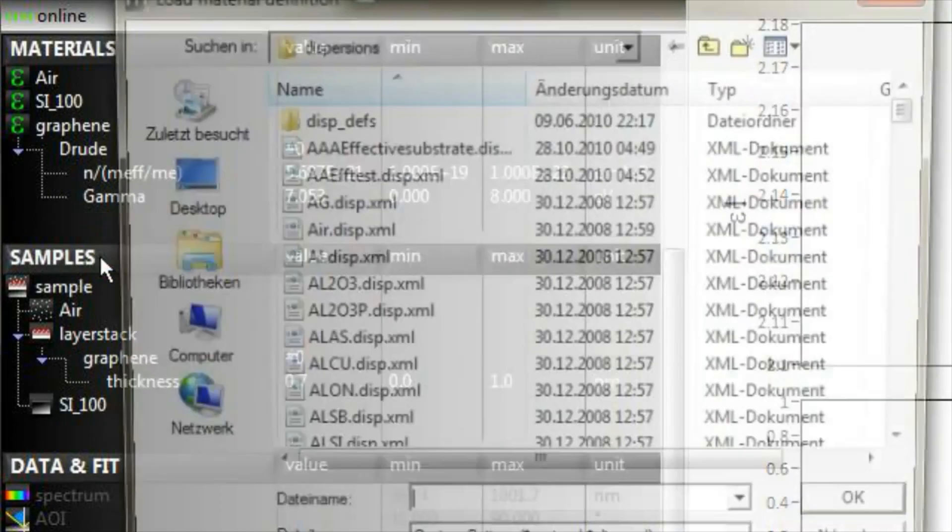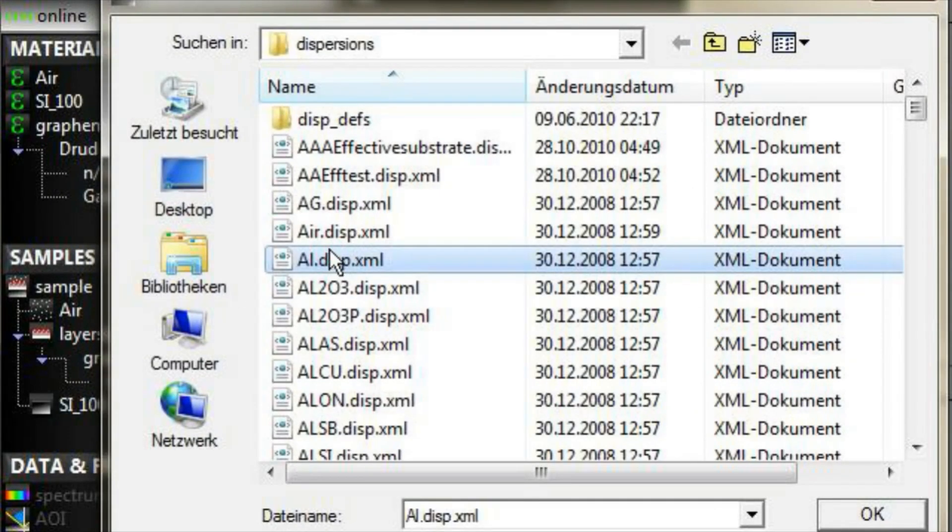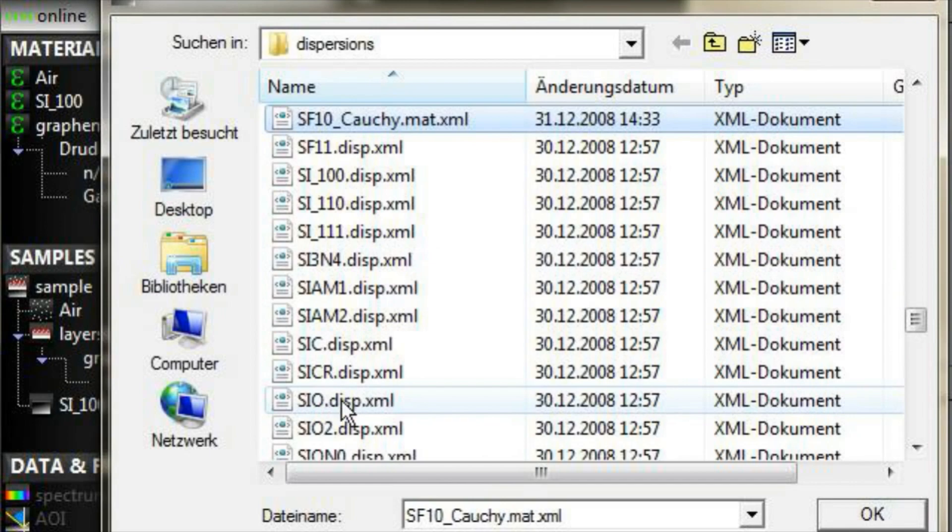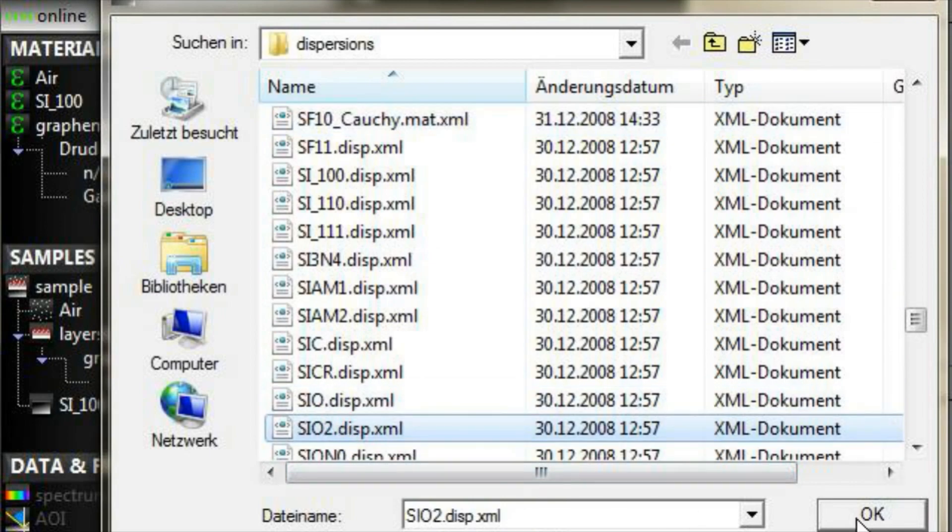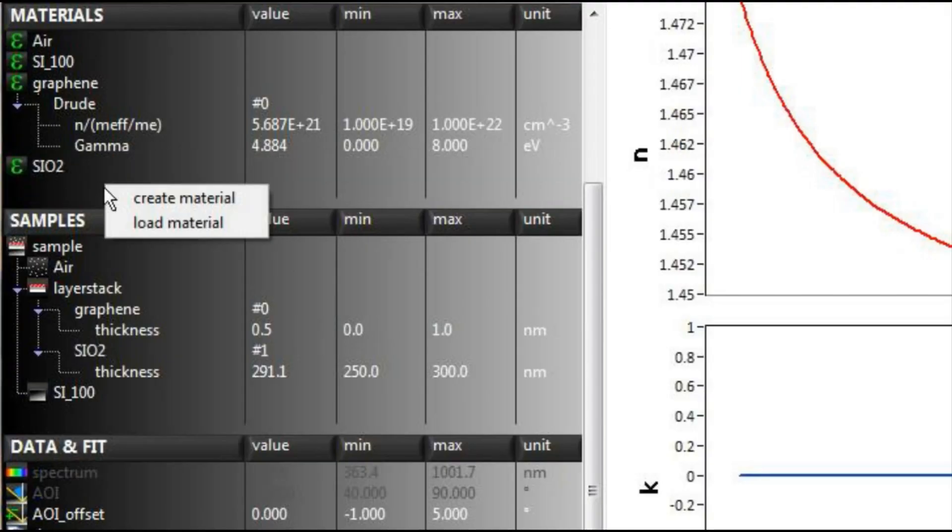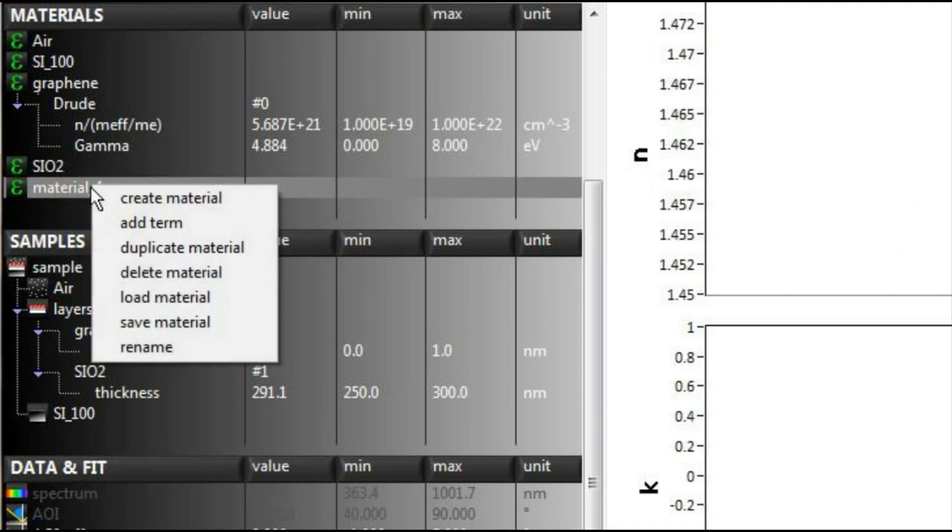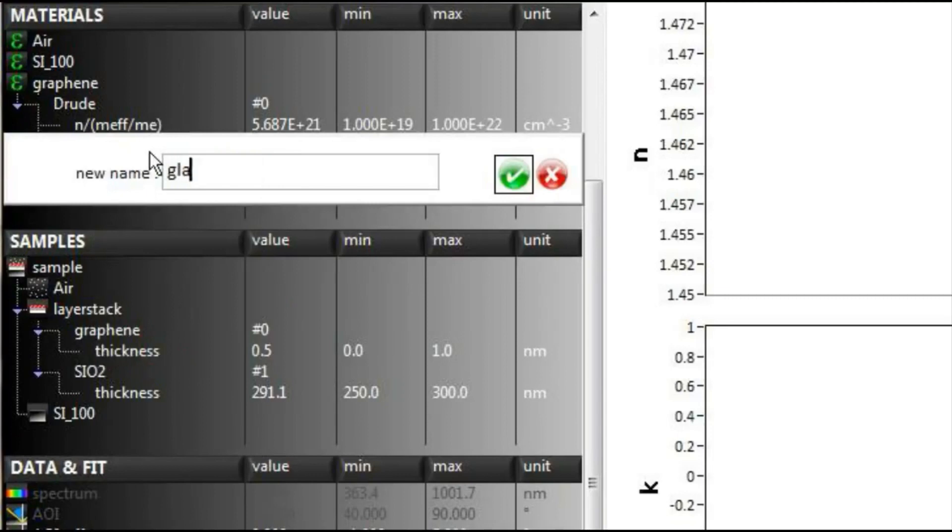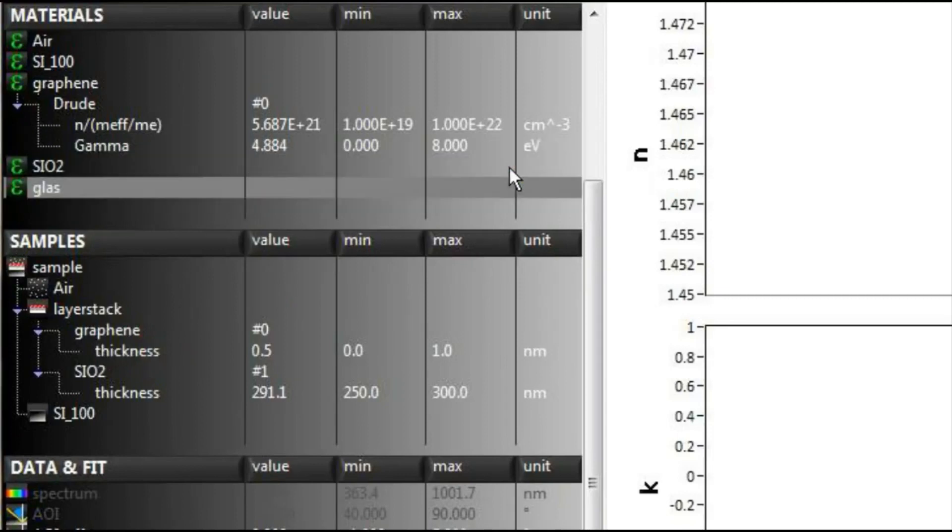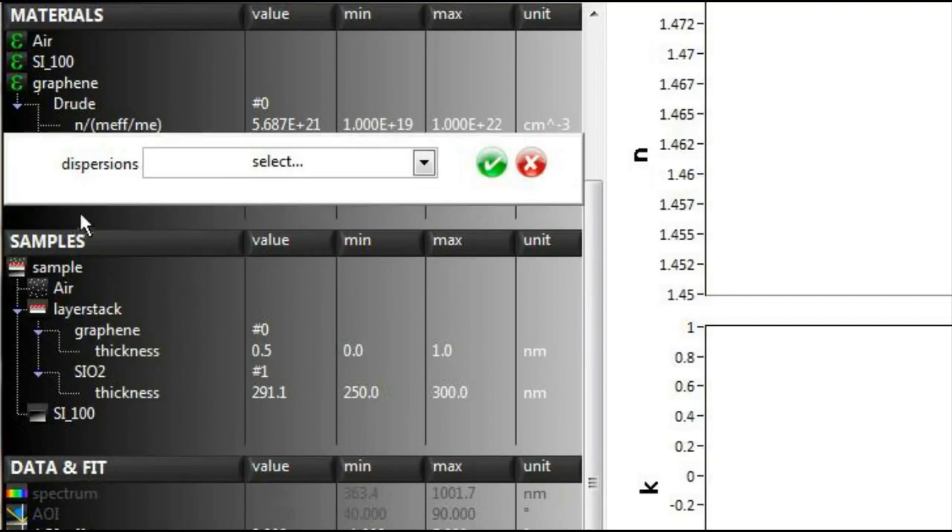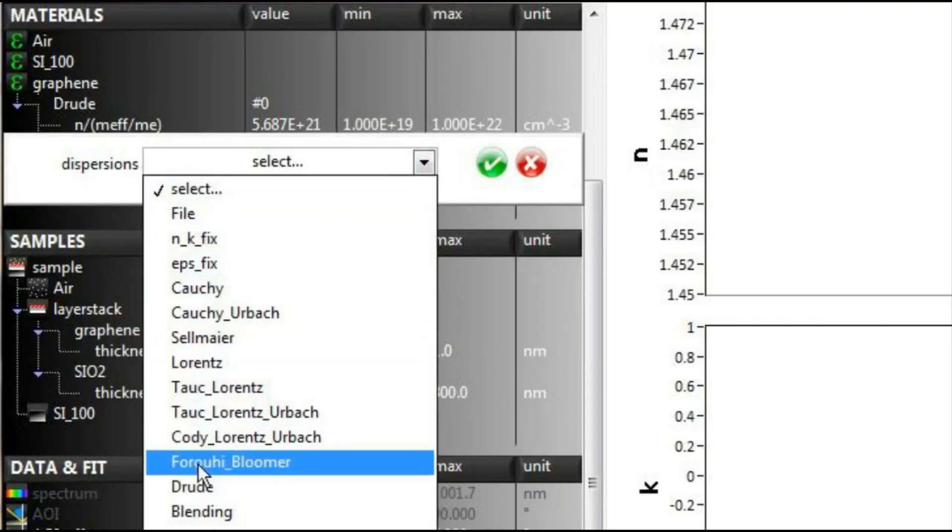In the material definition section, you may load materials from a database, or you may create your own material definitions. For self-defined materials, a number of dispersion functions as well as effective medium approaches are available.